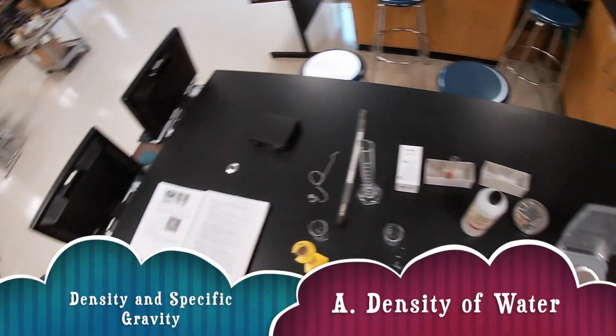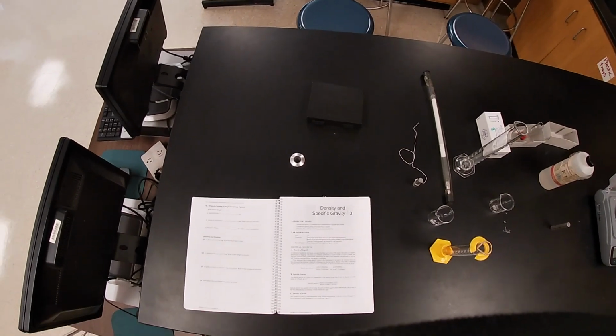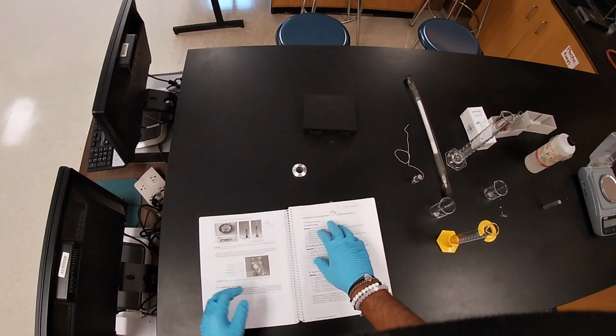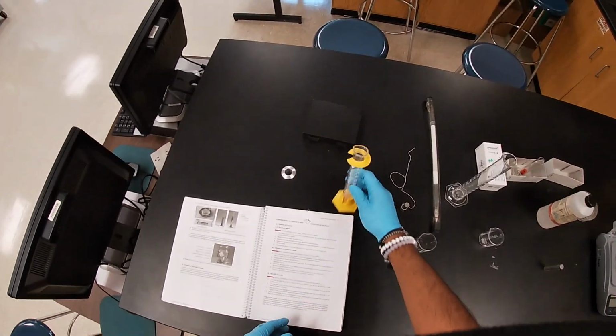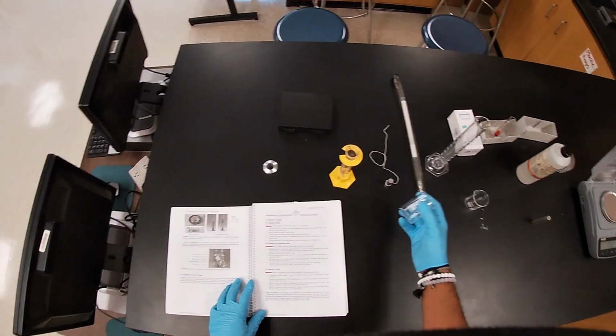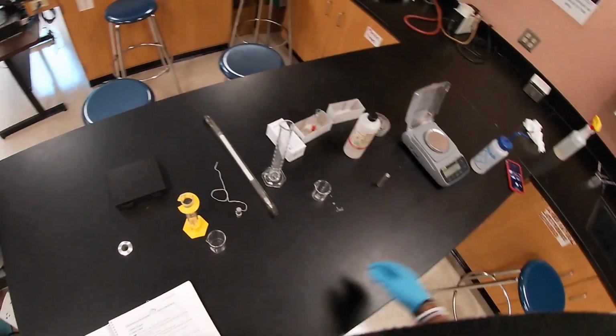All right, so for the density and specific gravity of 1106 lab, we're going to work on first the density of water. We've got our 50 milliliter graduated cylinder right here, as you can see. We've got our beaker. We're going to use a smaller one. I don't think we need a big, massive one. And then we've got our water.